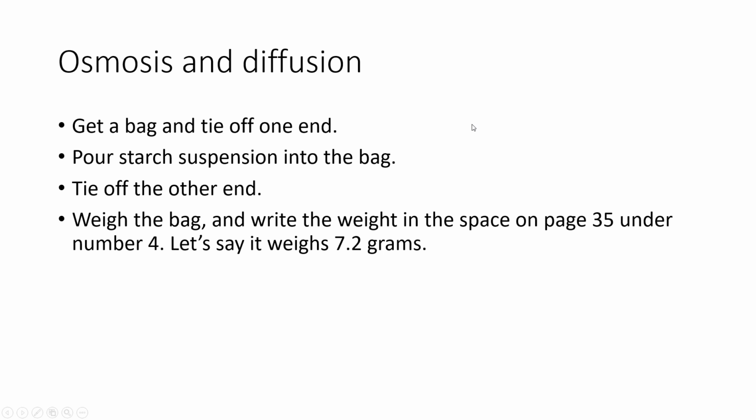Next up. This is something that we usually have the students do, and of course you guys don't have dialysis bagging at home, so you can't do this for yourself, but this goes back to that whole semi-permeable membrane aspect. What we usually do is we tie off a dialysis bag and then we fill that bag with a starch suspension. It's just cornstarch mixed with water.